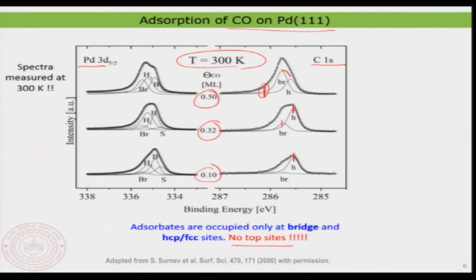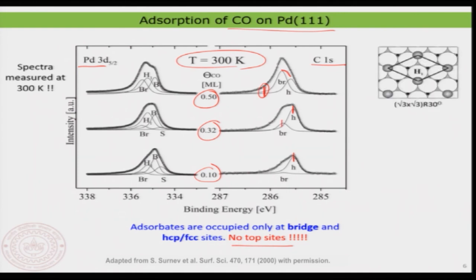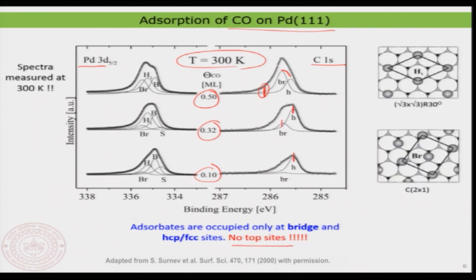Yeah, you can also see the same in the palladium resonance. So what is going on? That's quite interesting. That actually means the structures that we are seeing are nothing but just the √3 by √3 R30 structure. So that's one structure which we are seeing.